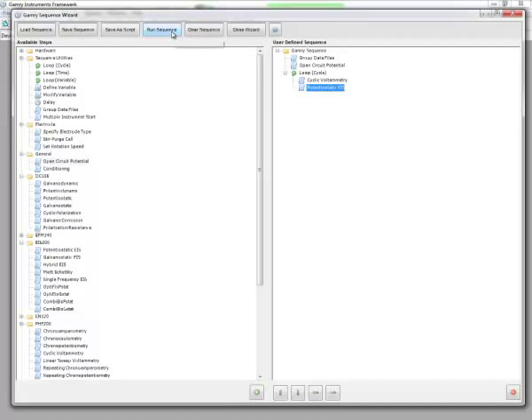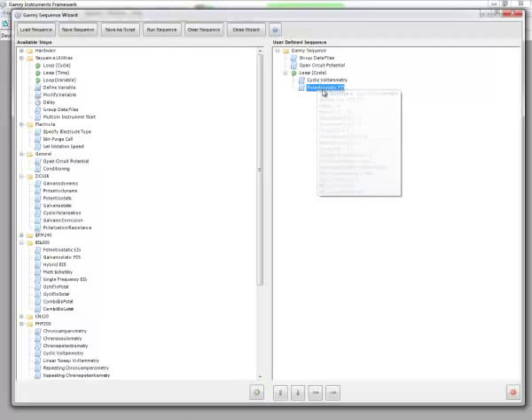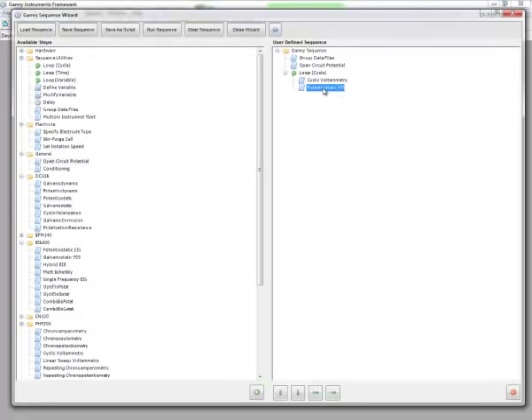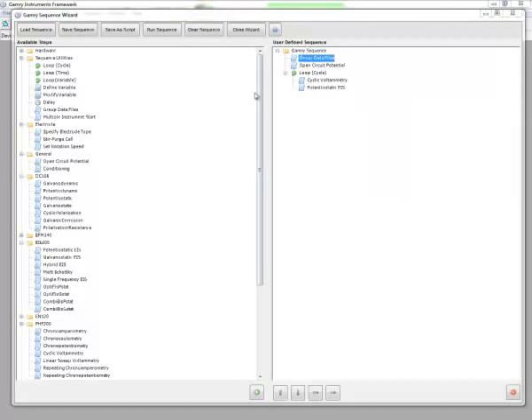And now I can click Run Sequence. And this will run the sequence that you see here. First, it's going to run an open circuit, and then it's going to run a loop 10 times based on running CV and potentiostatic EIS. And you'll notice another nice feature about the Sequence Wizard is that if I just hover over an experiment name, the set of parameters pop up for you to take a quick glance at.